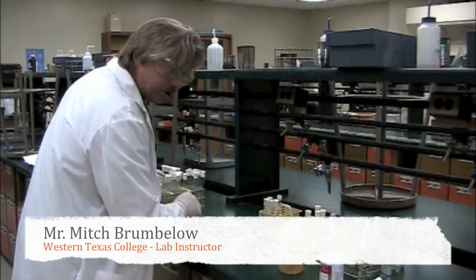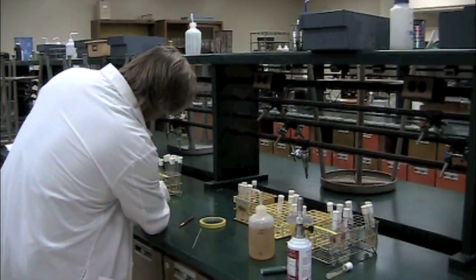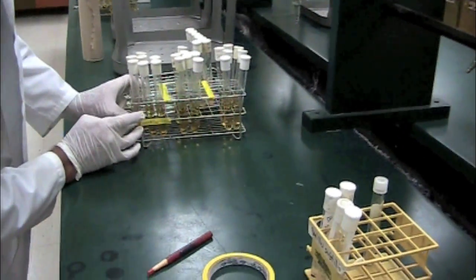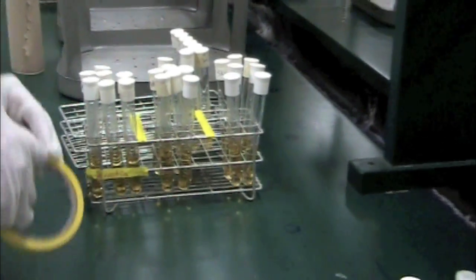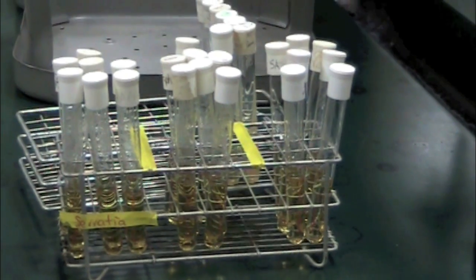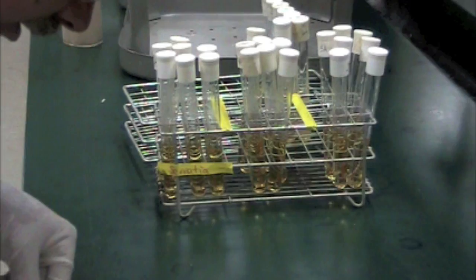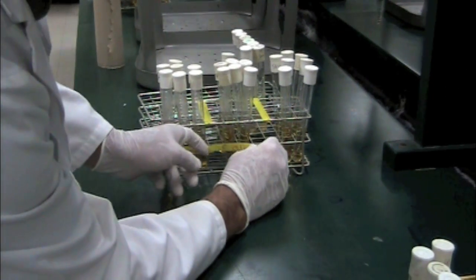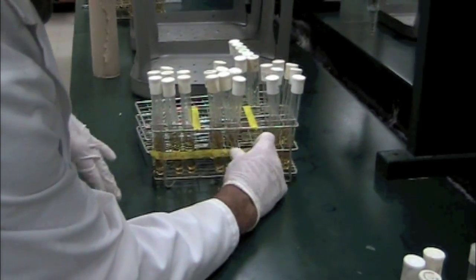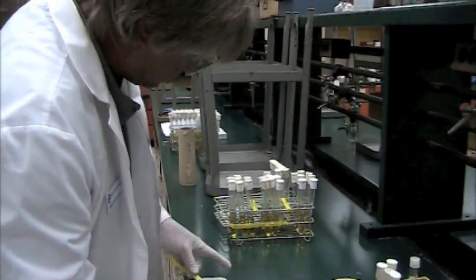Okay, so what I'm going to show you guys is some aseptic transfer procedure. Right now I'm labeling my rack with the name of the organisms that I'm using. I also have the tubes labeled, but with these organisms, you can't tell what they look like just from the outside, so labeling is very important. So I'm going to finish labeling this and I'm going to show you some aseptic transfer.